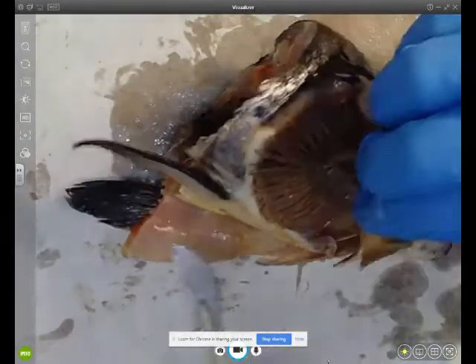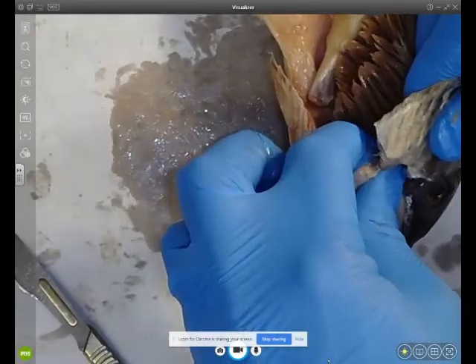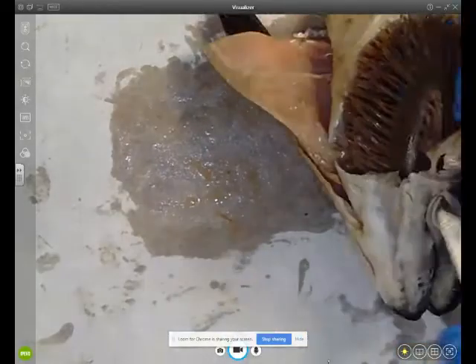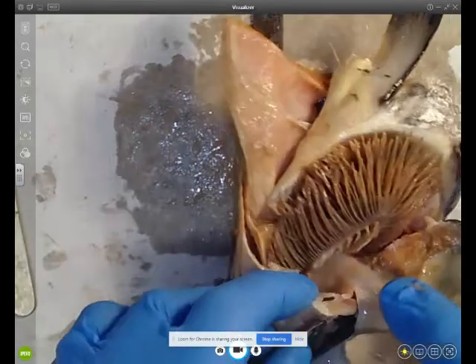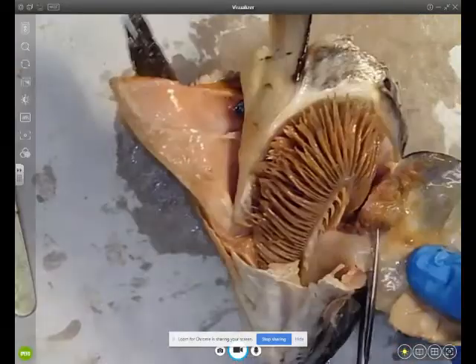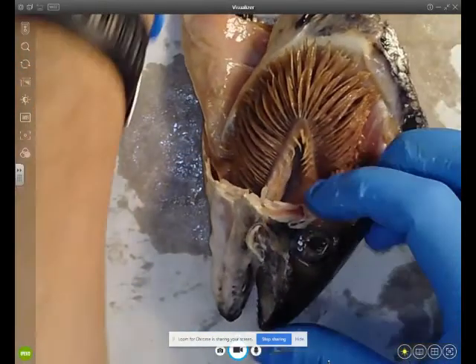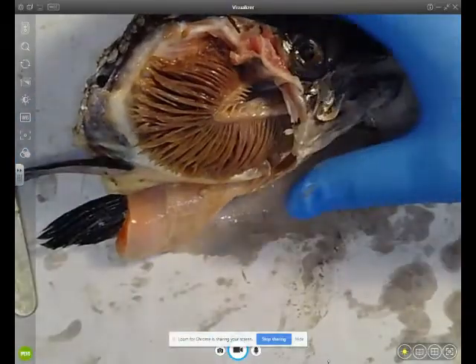It's quite tough to cut even with a scalpel, and I'm going to use a pair of scissors to cut the final bit of the operculum. Okay, there we go.